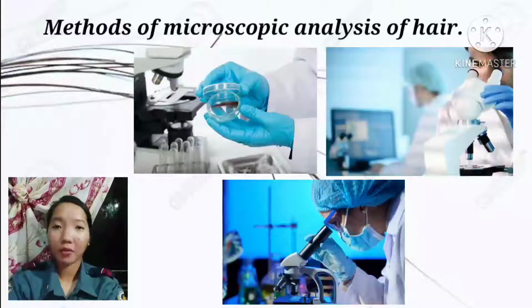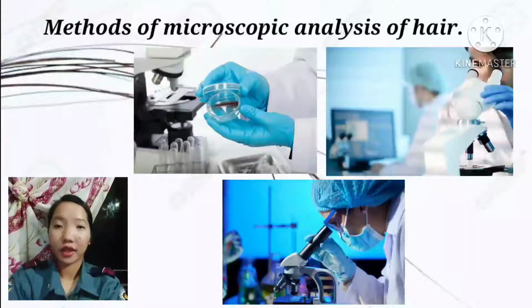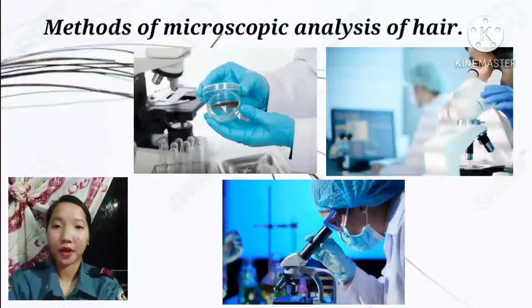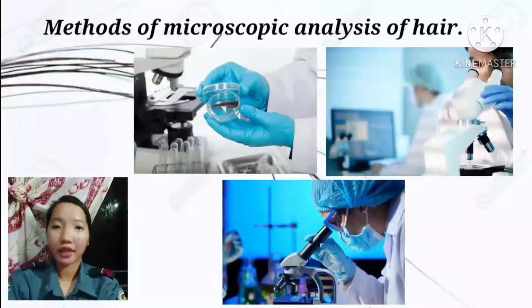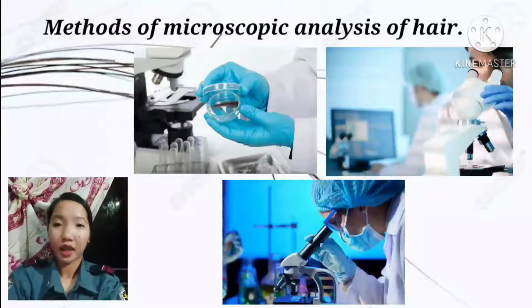Then kapag ang buhok ay galing sa animals, yung examiner ay i-identify ang species kung saan ito nag-originate. Then, if the hair is from the human, yung examiner is i-identify kung saang parts ng body nanggaling ang hair.